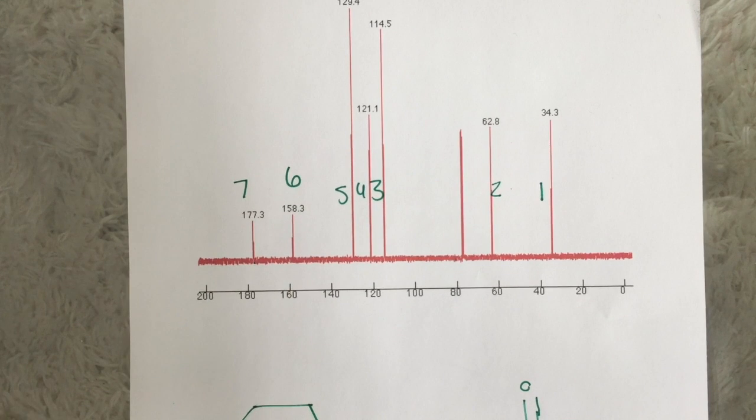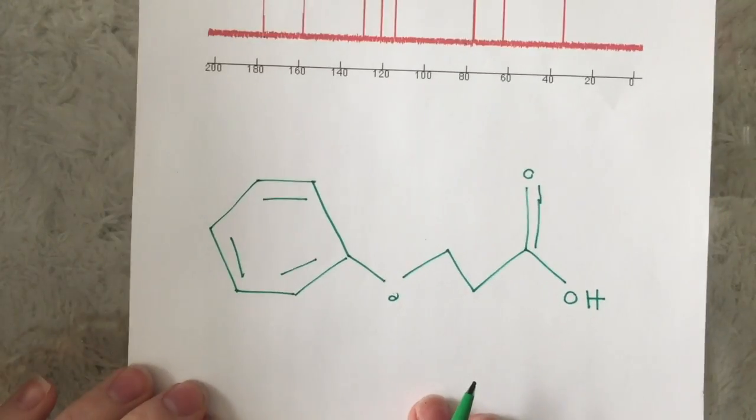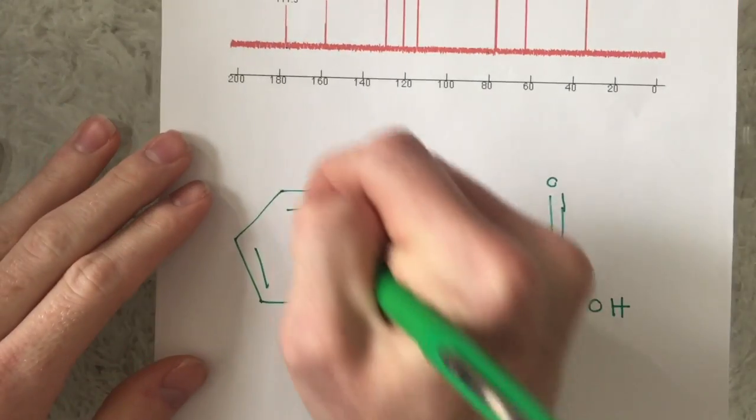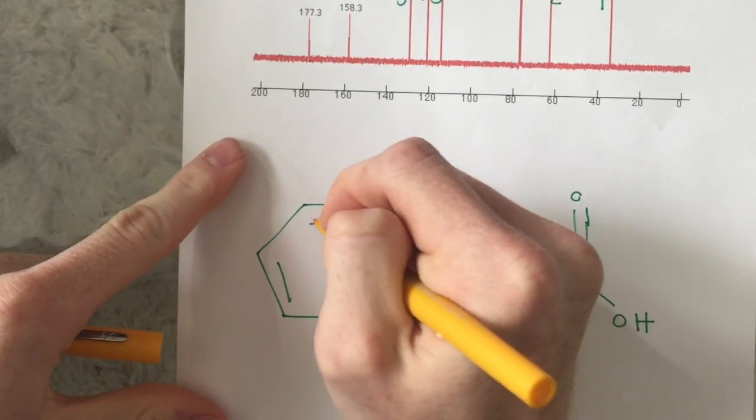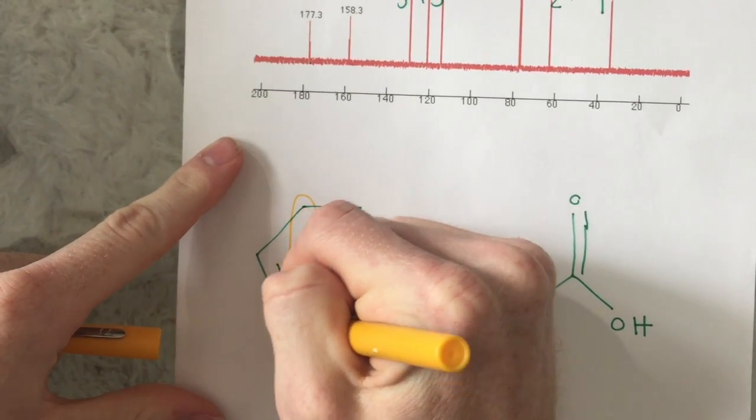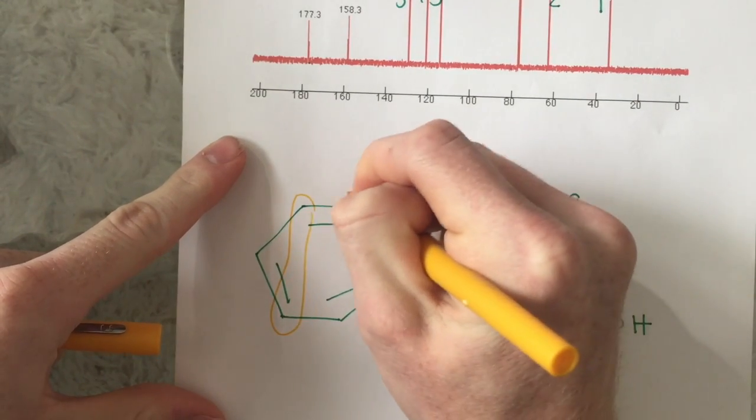And with the DOU, and also looking at the structure and identifying where the protons are, there are special environments. So looking at this, I'm actually going to use a different pen color. We're going to label this area as a special environment.